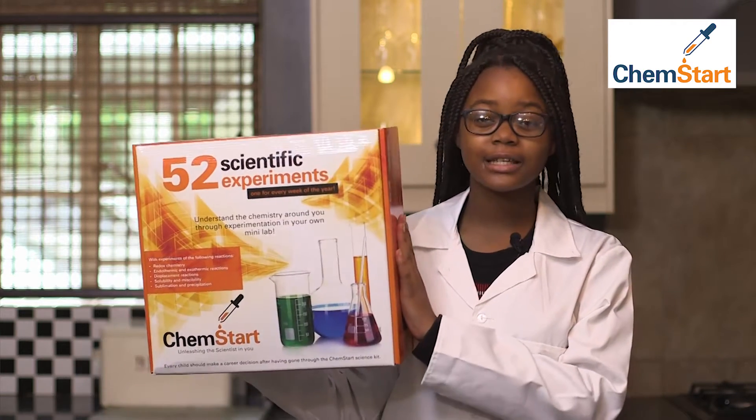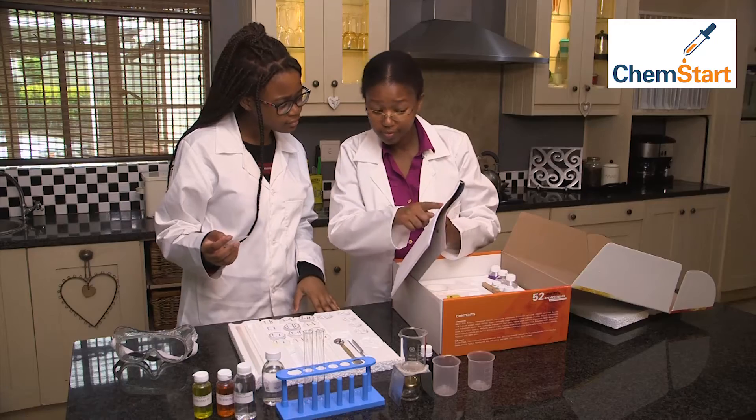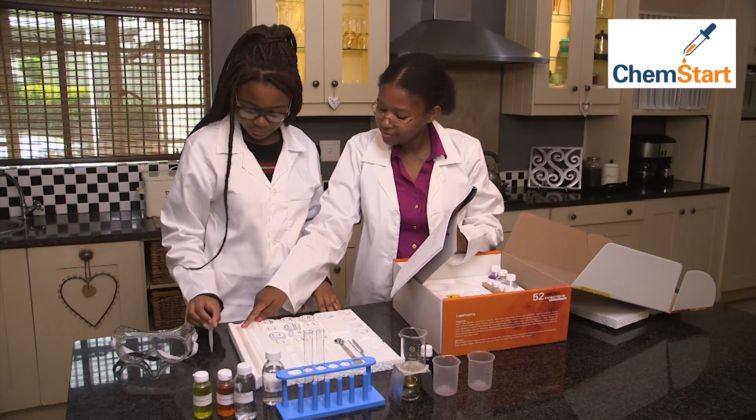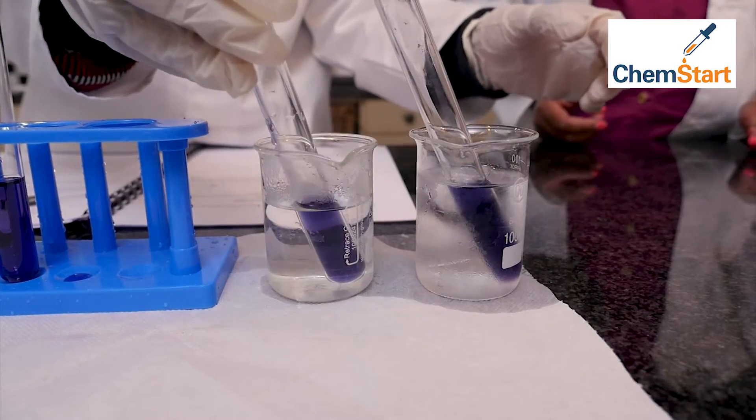Let me introduce you to ChemStart, a chemistry kit that you can do right in your own home or school. My mom invented these kits to help kids like me to conduct my own experiments and learn how it all works.